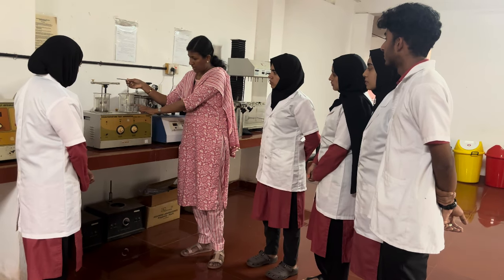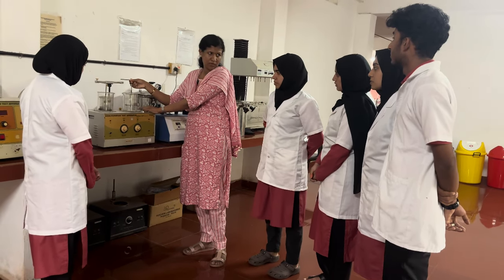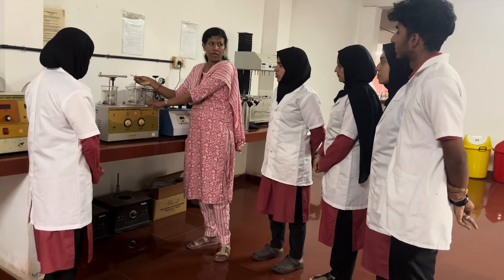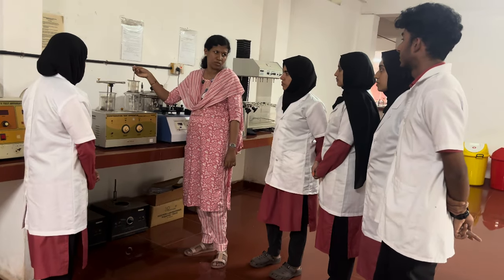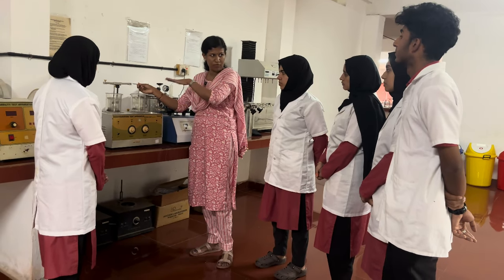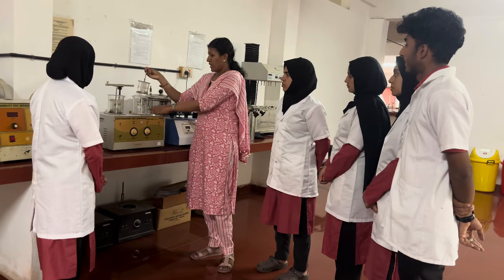During the upward movement, the tablet should be at least 2.5 centimeter below the surface of the liquid. And during the downward movement, it should not descend closer than 2.5 centimeter to the bottom. That is why we are selecting the volume of liquid in such proportion. So the tablet should not come closer than 2.5 centimeter to the surface or the bottom. Okay, so next we will go to the procedure.